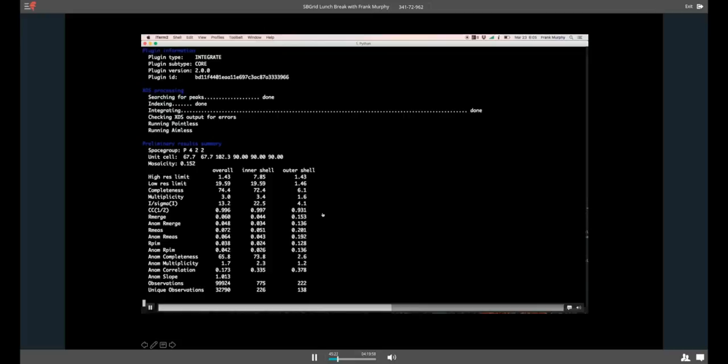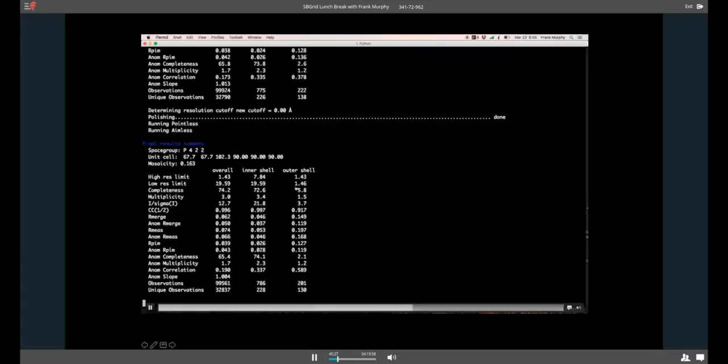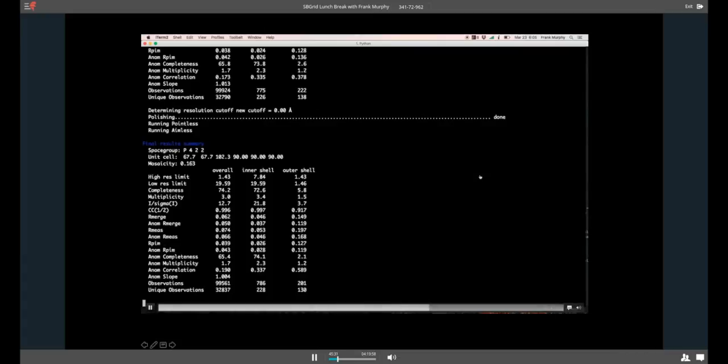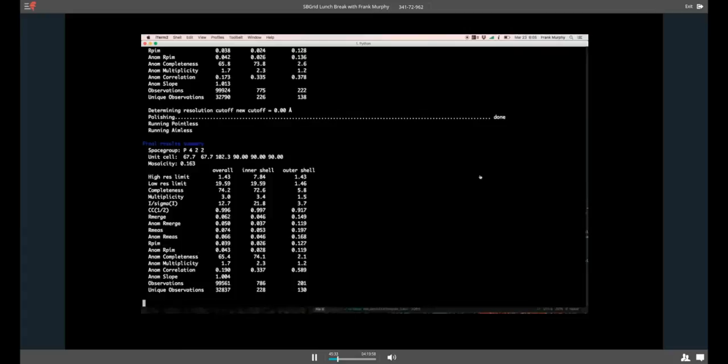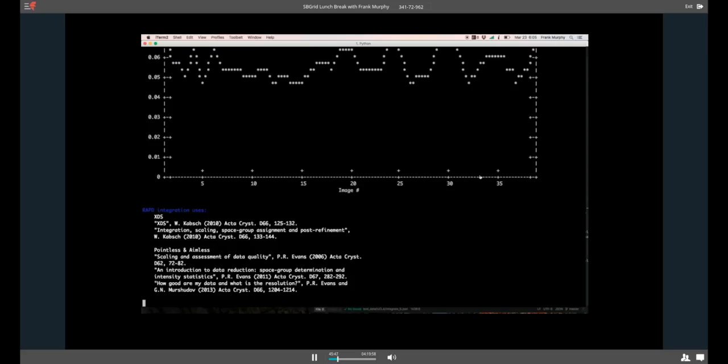It does the XDS processing. You can see, this is the same table one in ASCII format that we were just seeing in the web format. And it runs aimless and pointless and decides on a space group. It'll polish up the data. It'll give us a plot of the R-merge. I asked people here, what plot do you really want to see? And just give you R-merge so you don't have to go looking through the log files to see if anything's totally insane.